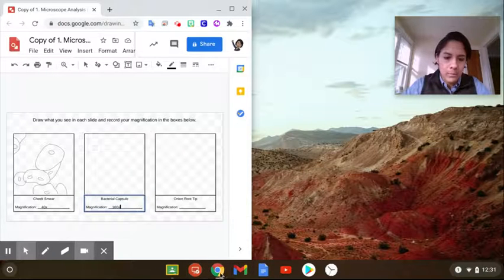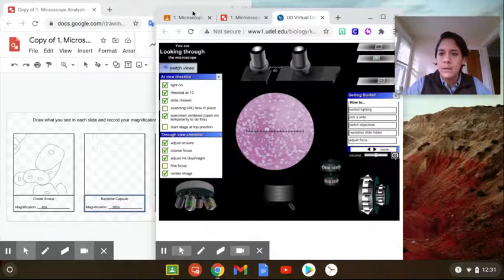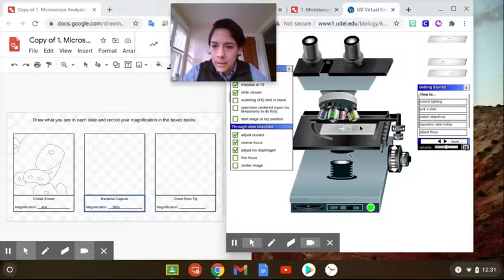And then bring up this again. Okay. So let me go ahead and move to the last one, which is the onion. Okay. This one, you'll be able to see the cells very clearly. Cool. That looks pretty good.